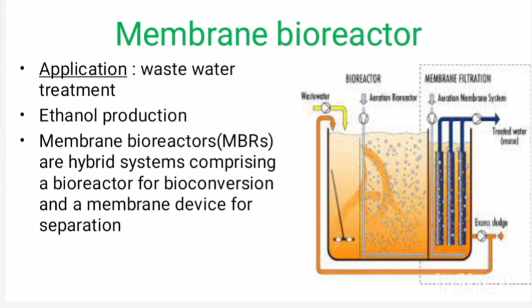Note the name, membrane bioreactor. So the membrane device is for the separation and the bioreactor is for the bioconversion, that is the product formation.